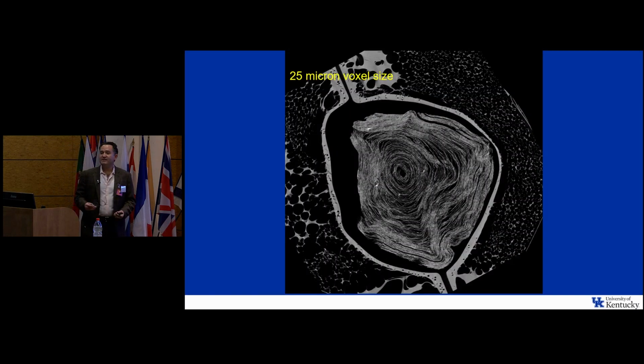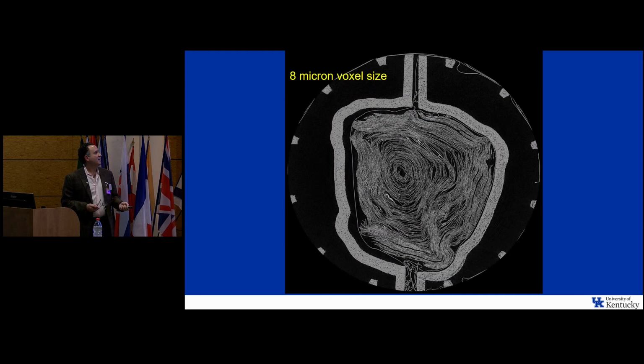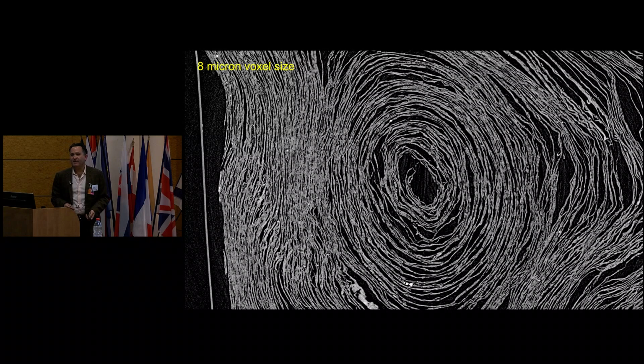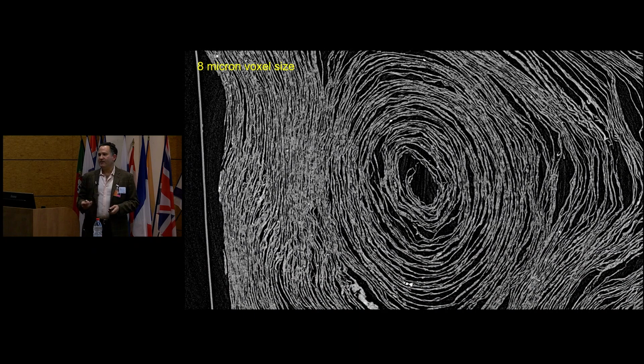Now, the Diamond data is just coming to us. We're only now at the stage of beginning to process and play with the reconstructions, but we do have some images, fortunately, to show you here today. So here's basically p-Herc Paris 3 at 25 microns, 8 microns. There are some close-up shots. Again, conveying that right now, the approach that we're taking is we need to get in there at the resolution that we think we require for the deep learning method to work.